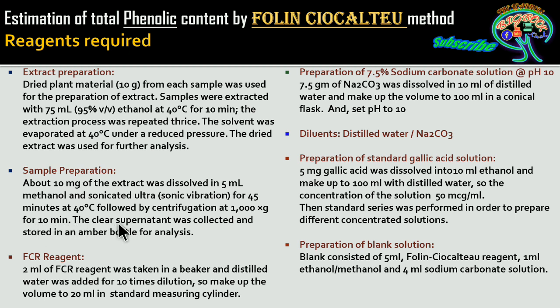The clear supernatant was collected and stored in an amber bottle for analysis. After doing this repeatedly, we have to collect enough amount of the sample required to perform the experiment.